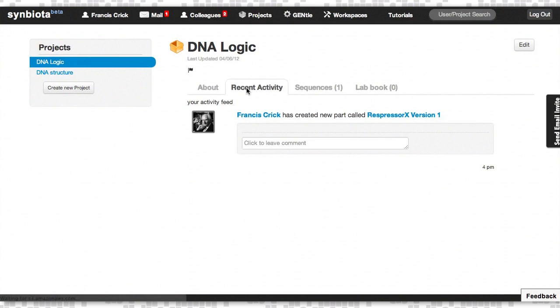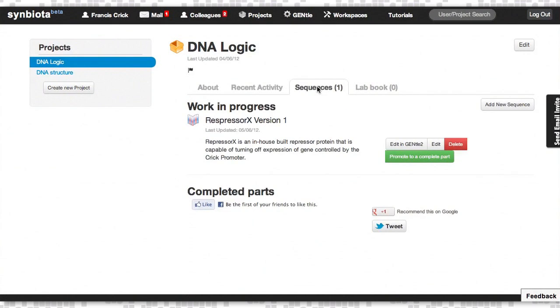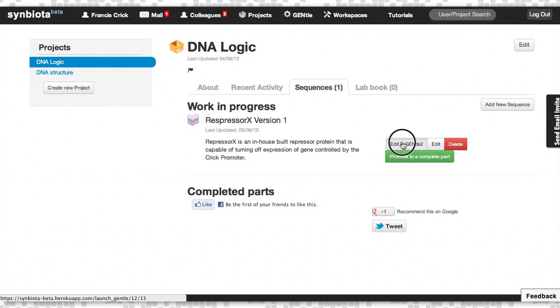Recent Activity. Sequences, which is a repository of all the DNA sequences you've created using Gentle, our Gene Designer tool.